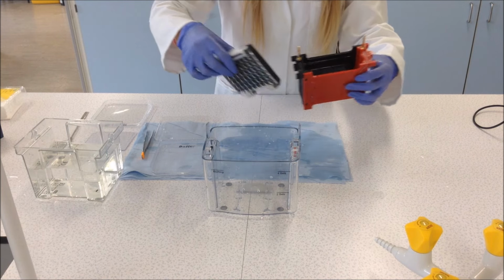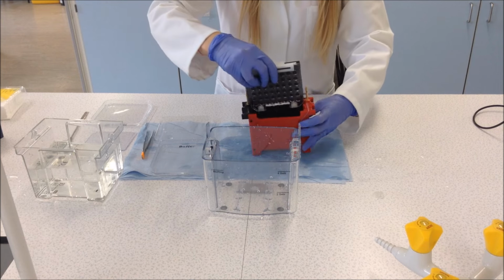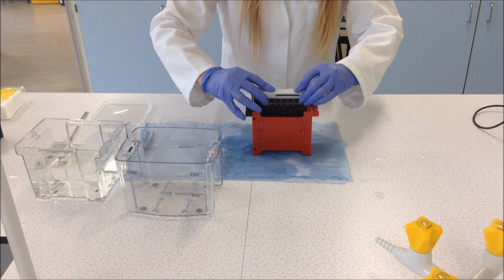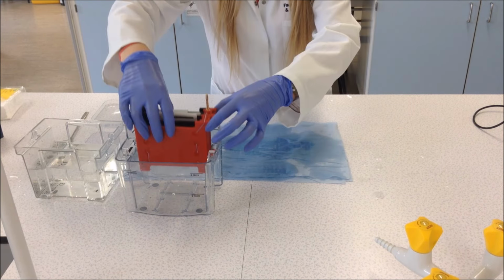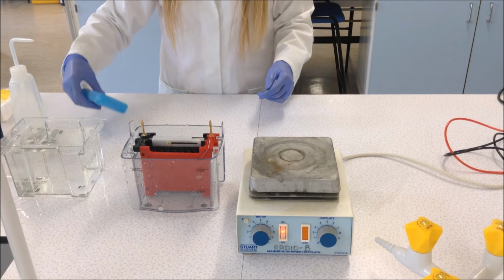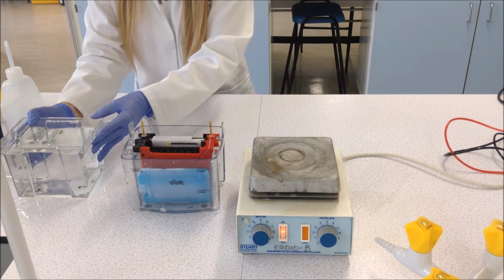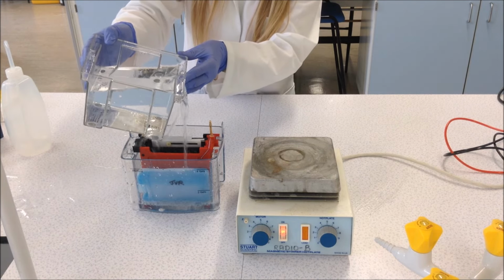So what you do is bring over the blotting module and place the cassette into it, ensuring that the black side is facing the black side. Once the module is in place, you can then place it into a gel loading tank. With the assembly complete, you add a magnetic stirrer and an ice pack to ensure that the whole module is kept cool, and you then fill it up with transfer buffer.